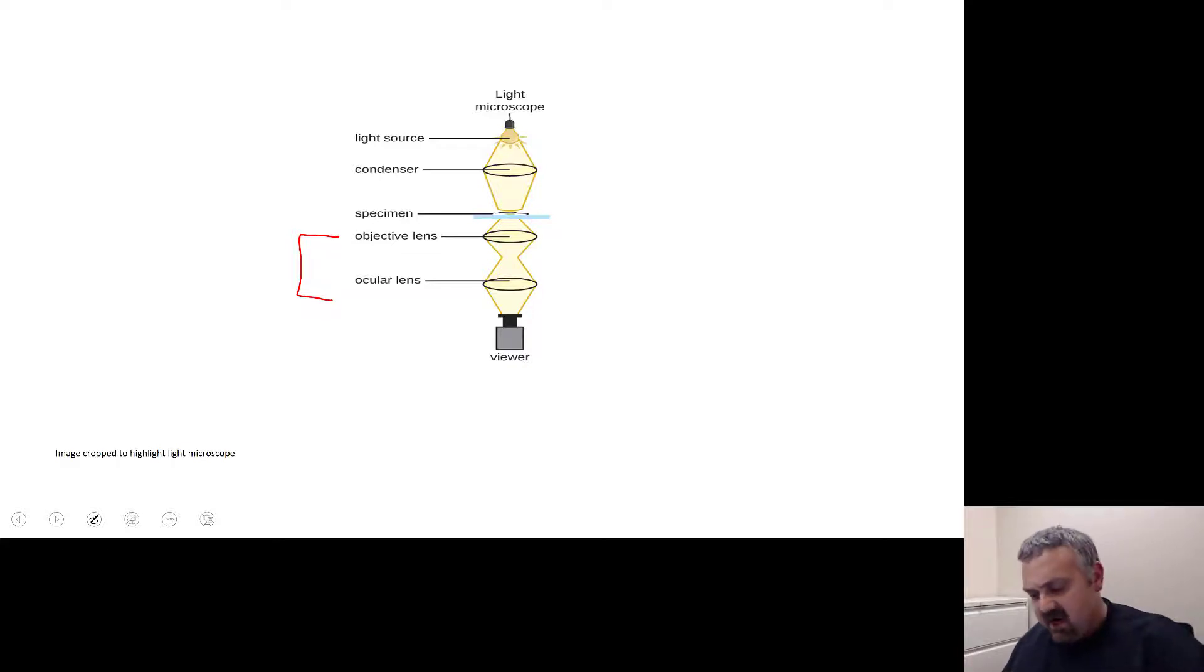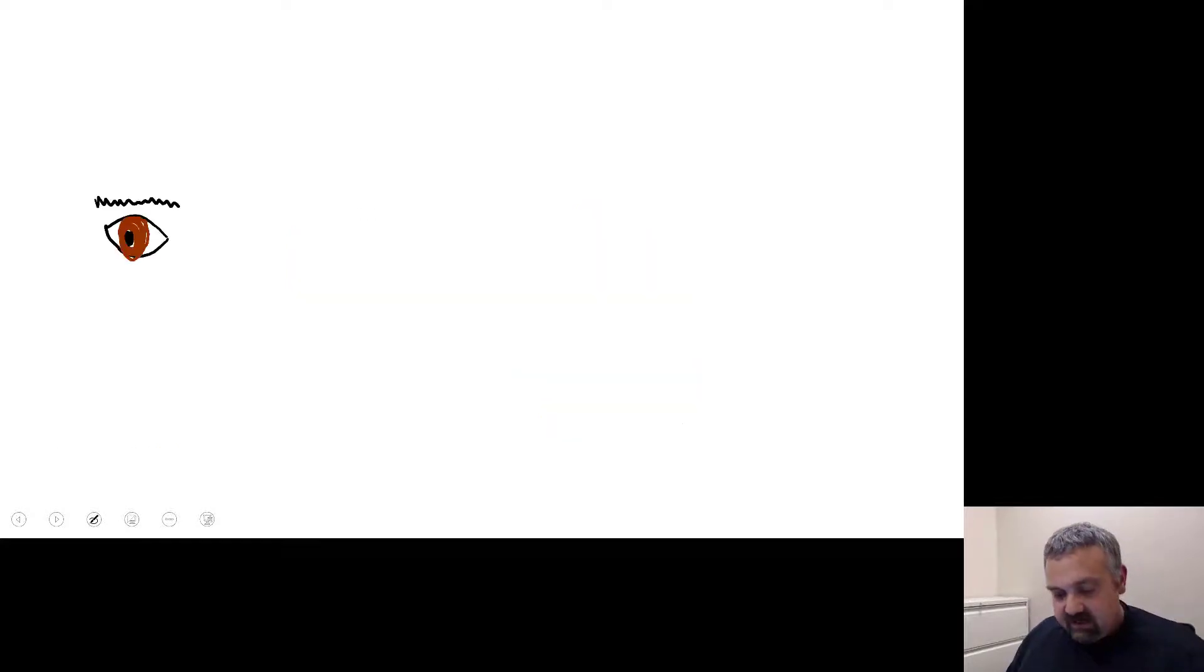So for example, if we're using an oil immersion microscope with a 100x objective, and our ocular has a 10x objective, we're going to get a total magnification of 1,000 times. But how? Well, let's take a look.